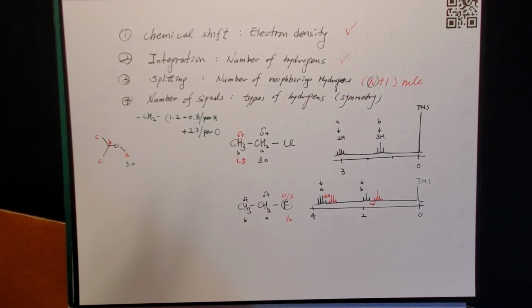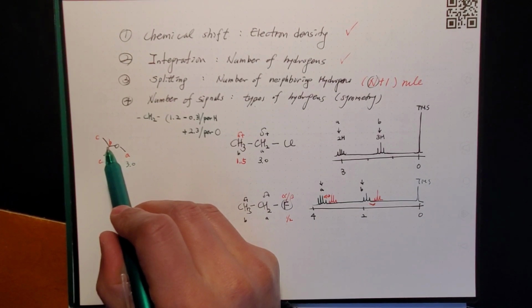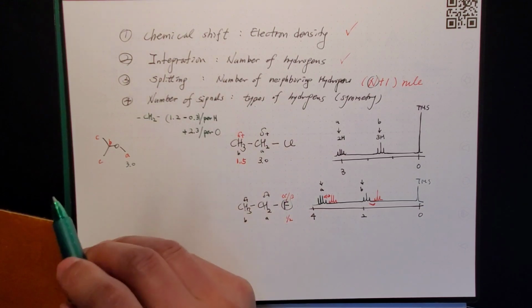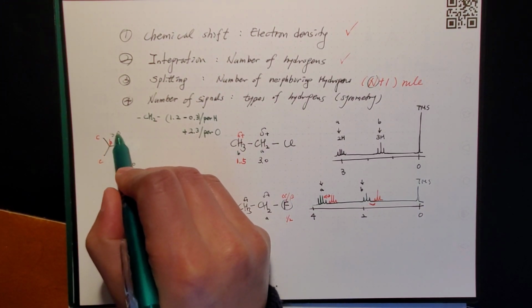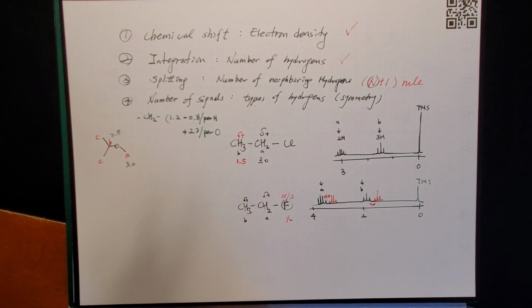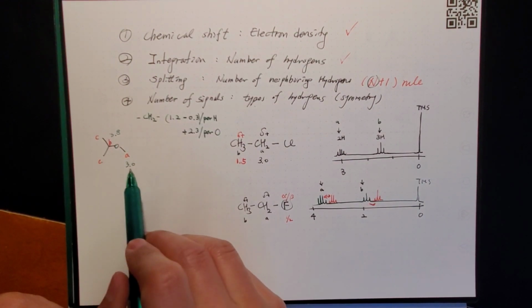3.0 ppm. Okay. But this one has lost hydrogen. So you add 0.3, so 1.5. Then you have oxygen. So roughly 3.8 ppm. Because you're losing hydrogen, it got more than this.